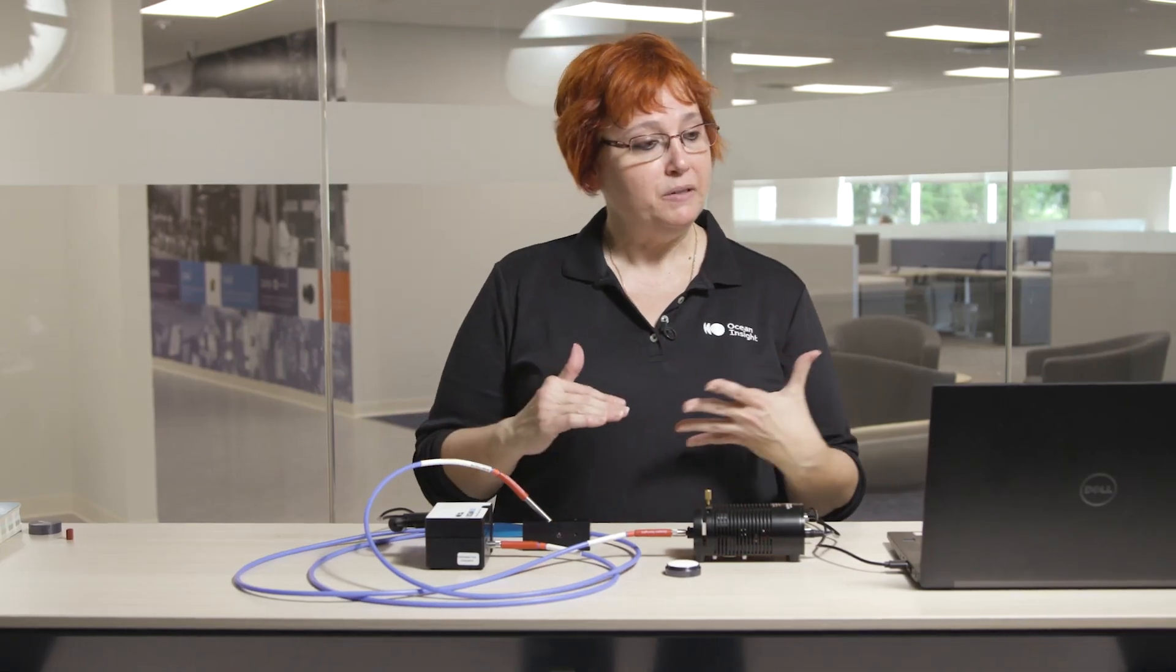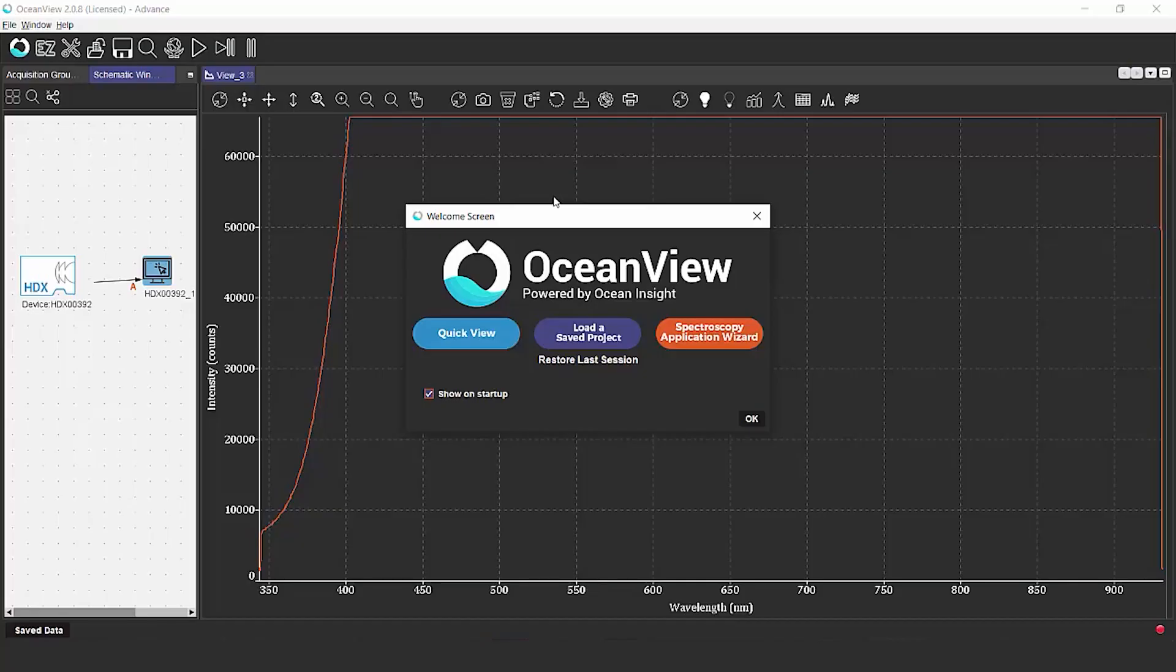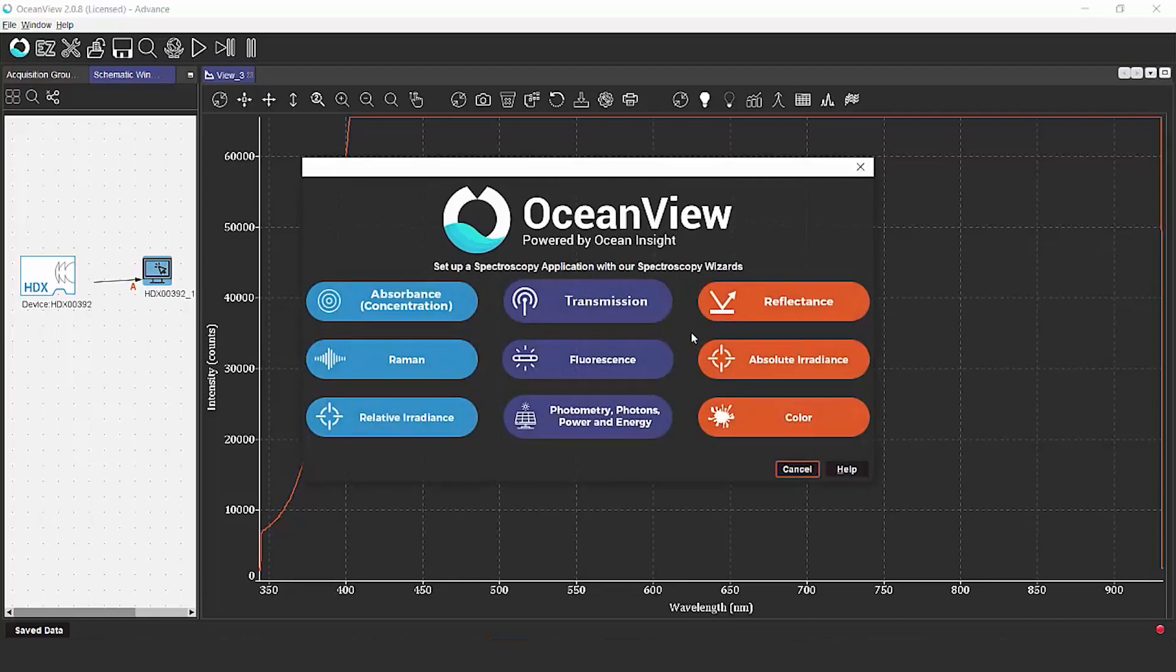So the next step is going to be to start our OceanView software. You're going to go to spectroscopy application wizard to find the reflectance wizard, which will help you get your setup into reflectance mode.